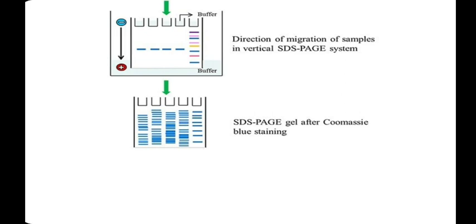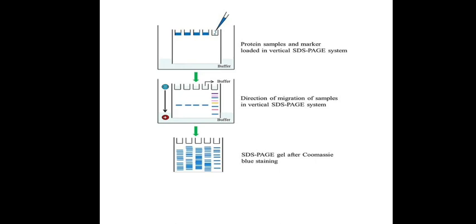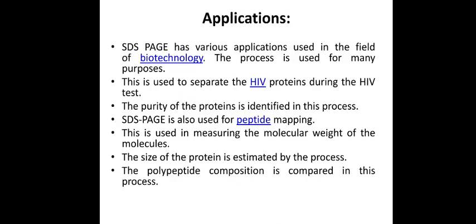So you need a tracker dye, and then you stain these proteins using a protein stain called Coomassie blue, or sometimes nowadays even they use silver stains. Most commonly used recent stain is a silver stain. So either Coomassie blue or by using silver staining techniques, you can get the bands, which is similar to the bands which you get in agarose gel electrophoresis. And then later on you can identify the fragment length by using a reference.